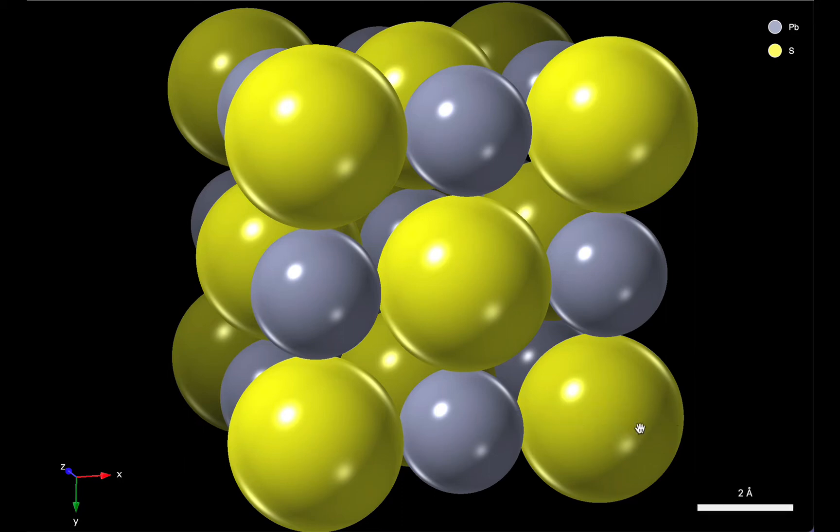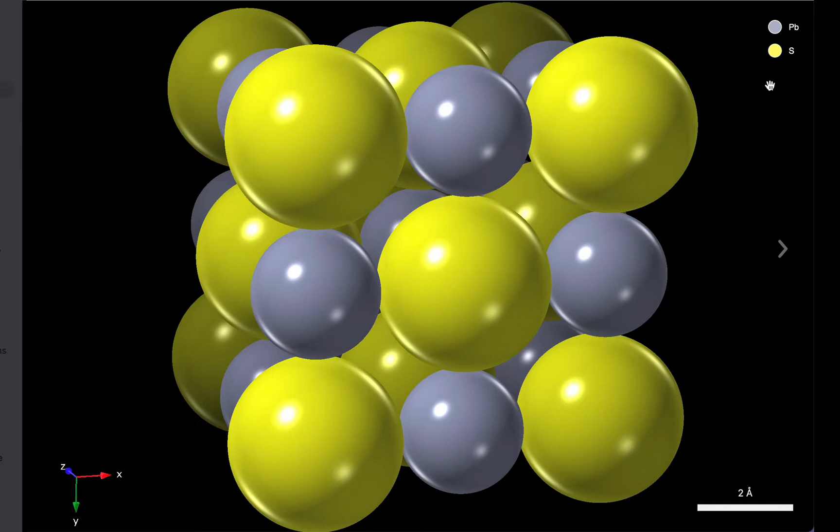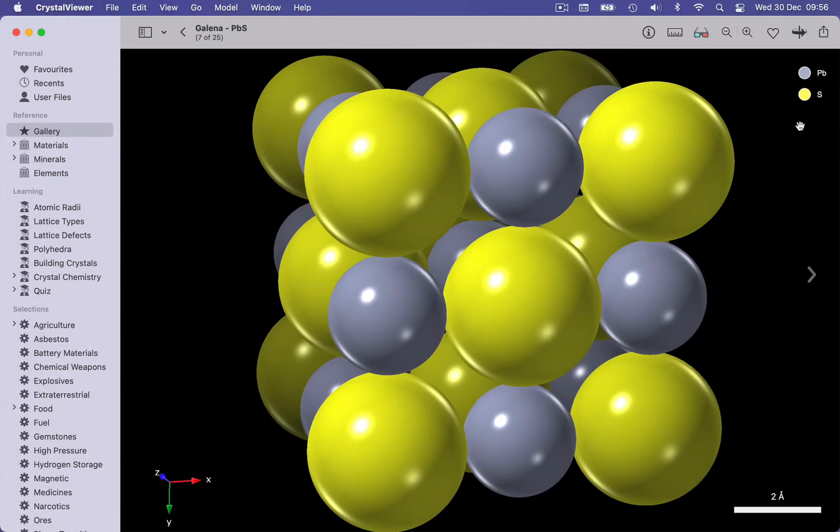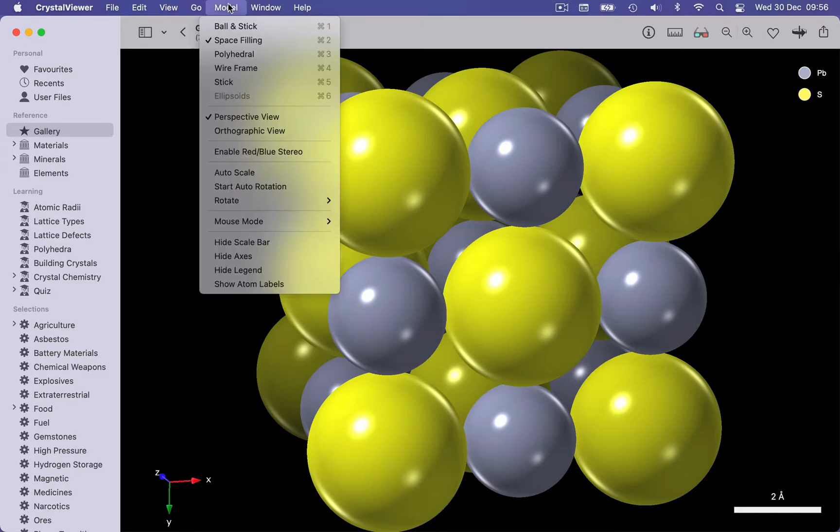So how did I know which atom was which? Well, in the top right-hand corner of the window, we have a legend, which helps us identify which colour corresponds to which atom in the structure. And notice that we can show or hide the axes, the scale bar, and the legend by using the model menu.